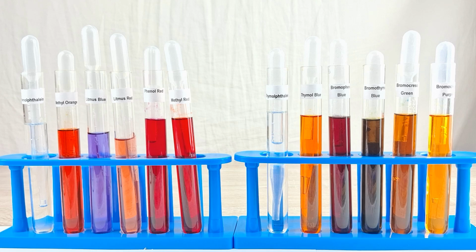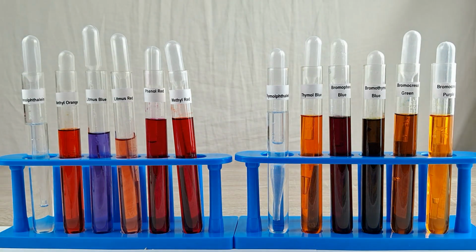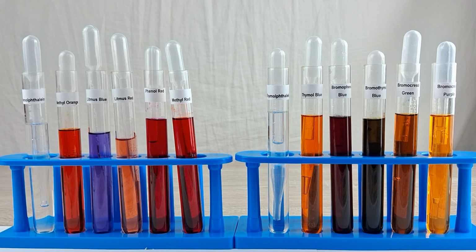For this video, I've poured out samples of each indicator into clean and dry test tubes to have a visual overview of their original colors in solution. Some of these indicators are water-soluble dyes, while the rest are soluble mostly in alcohol. Accordingly, their respective solutions were prepared using either water or alcohol as a solvent.